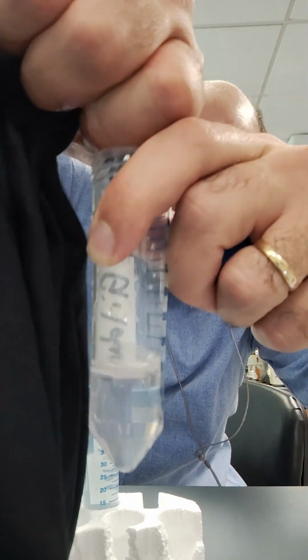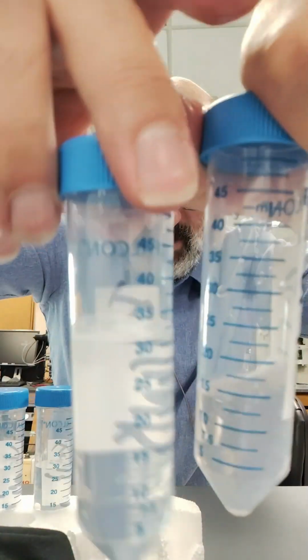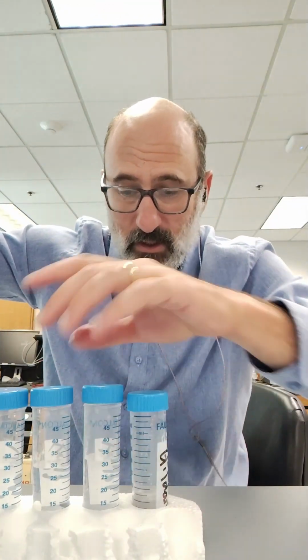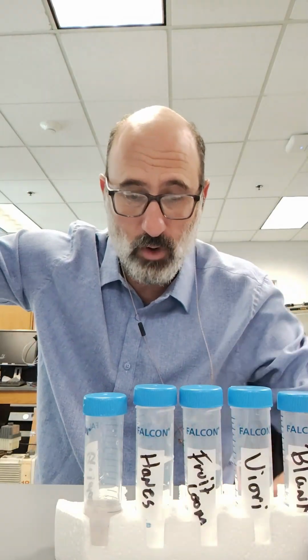And then we lost some water. Got about 15 mils left. We're going to do this for all the shirts. So this is what blank water looks like. I don't know if we've got anything in there, but we'll find out. Now we're going to repeat this for the Hanes, the Fruit of the Loom, and the Vuori shirt. And then we'll have them all.